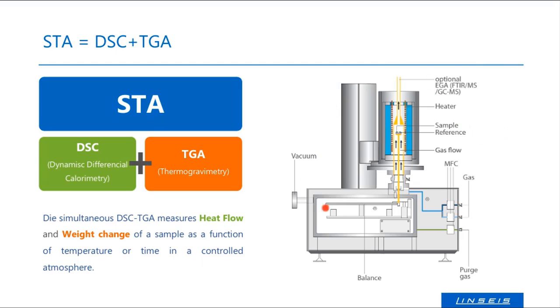If you do the same setup but without a DSC sensor, but just with a normal TG sensor, you have the TGA version. And if you skip the balance, so if there's no balance down here, then you have a classical DSC instrument. So you see the combination of both really is both techniques within one instrument.